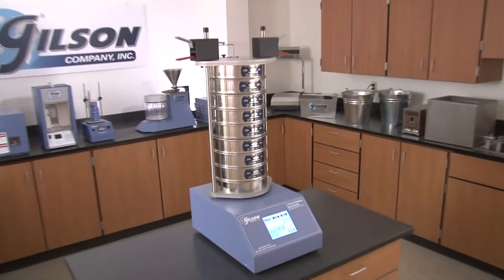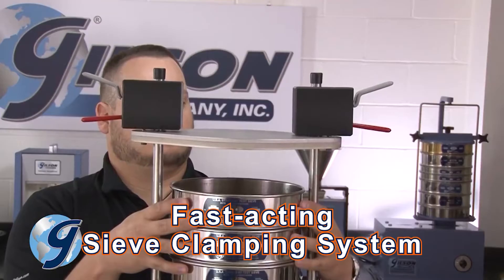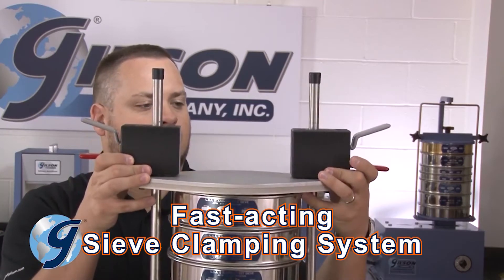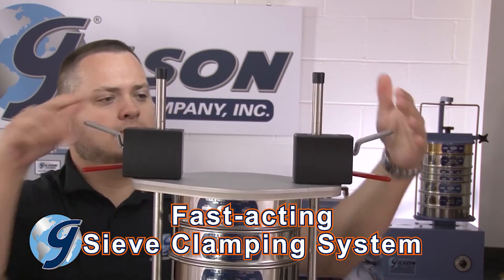This quiet and compact benchtop unit features a fast-acting clamping assembly that quickly and easily locks and unlocks sieves in place, assuring efficient transfer of vibration energy.